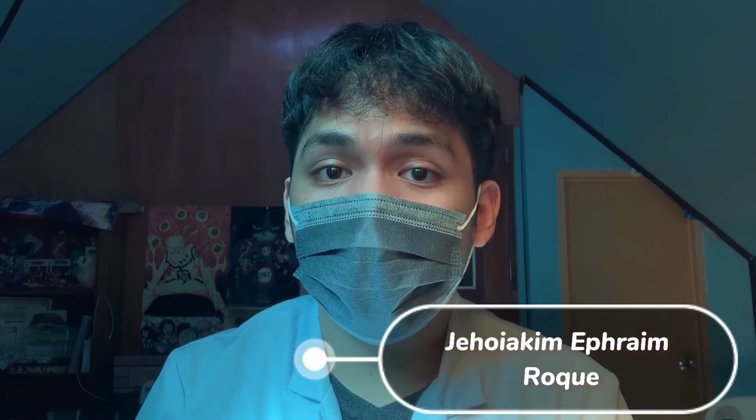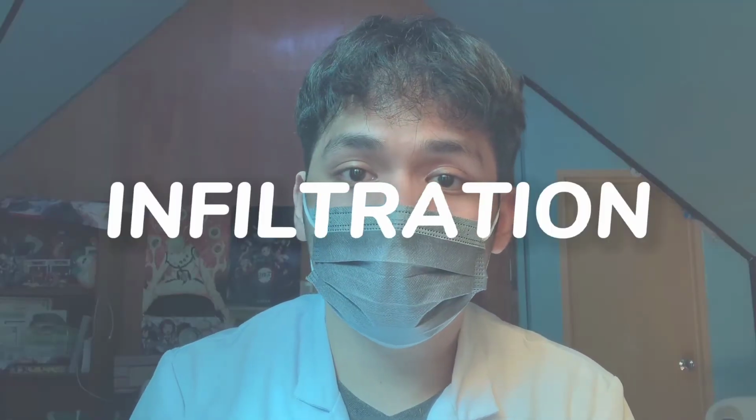Hello there, welcome. So in this video presentation, we are going to demonstrate the remaining steps for tissue processing. By the way, I'm Jehoiakim Ephraim J. Roque, and I will be demonstrating the infiltration process.